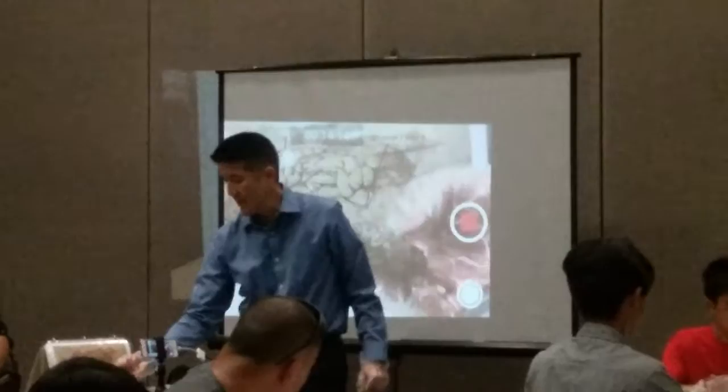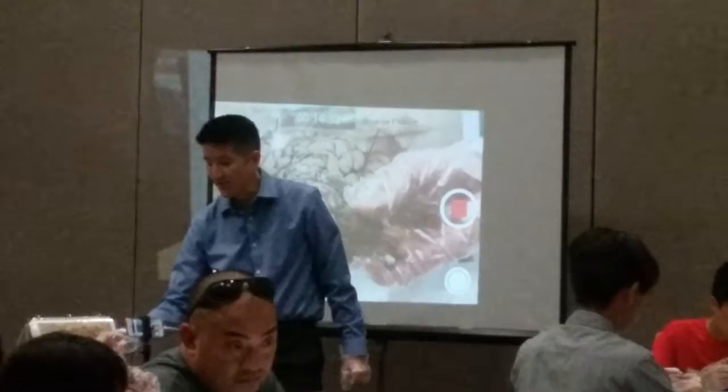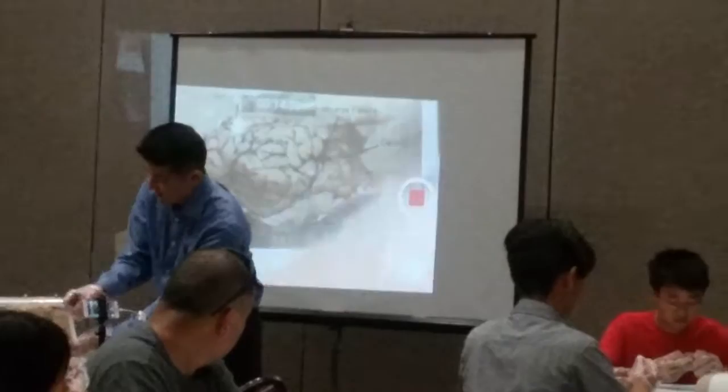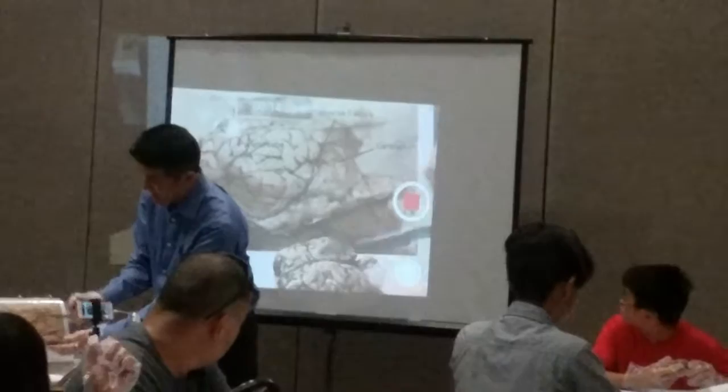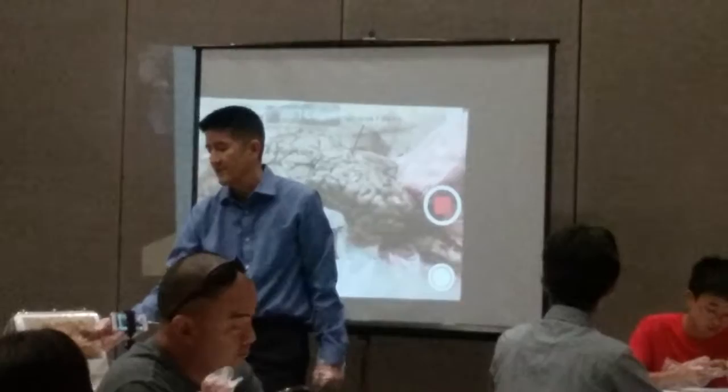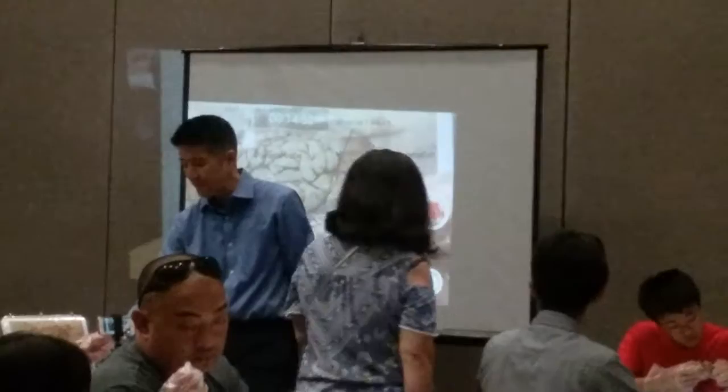If you look at the brain surface, you can see some veins on the surface. The veins are mostly located in the creases between the ridges. The ridges are called gyri — singular is gyrus. So this one here is the superior frontal gyrus, the middle frontal gyrus, the inferior frontal gyrus. The creases in between are called the sulci — that's plural for sulcus. We use this terminology because when you do surgery, there are different things you expect to find in different parts of the brain.